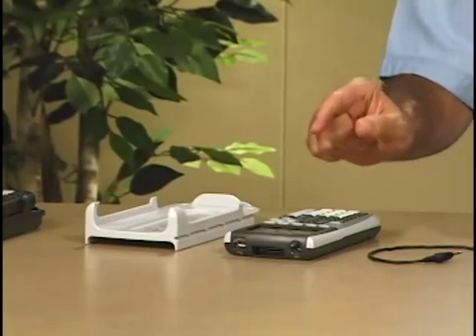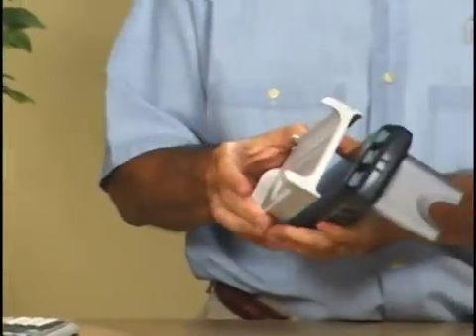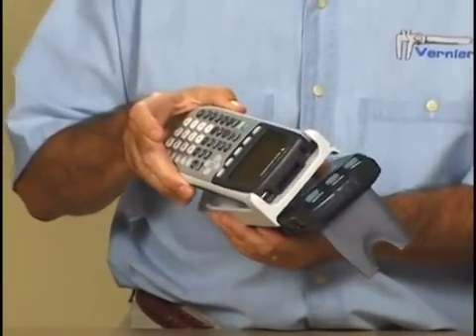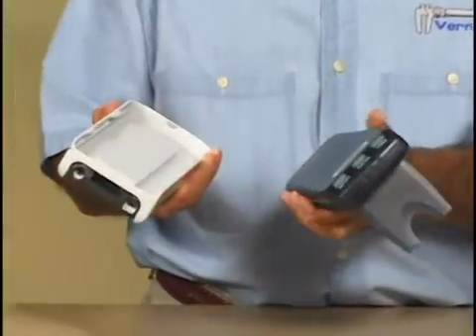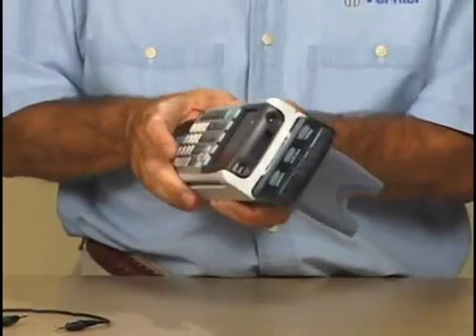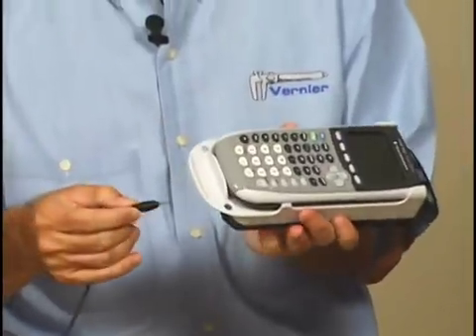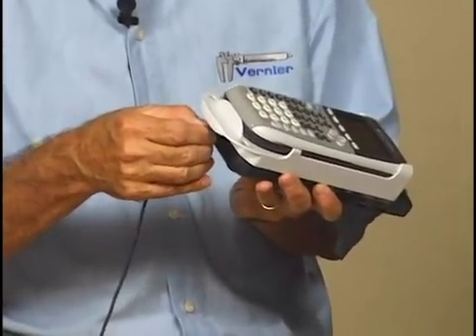To connect the TI-84 Plus to the LabPro, take that cradle, take the graphing calculator, slide the top of the graphing calculator into the cradle, and snap it down. Take the cradle and slide it onto the top of the LabPro — it'll snap in place. Take the cable and connect the bottom into the bottom of the LabPro.